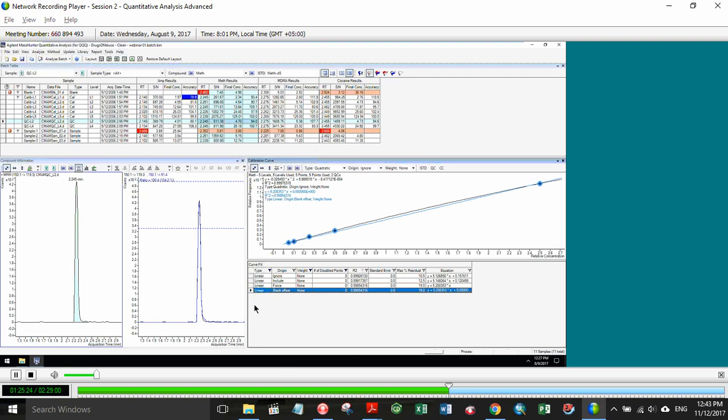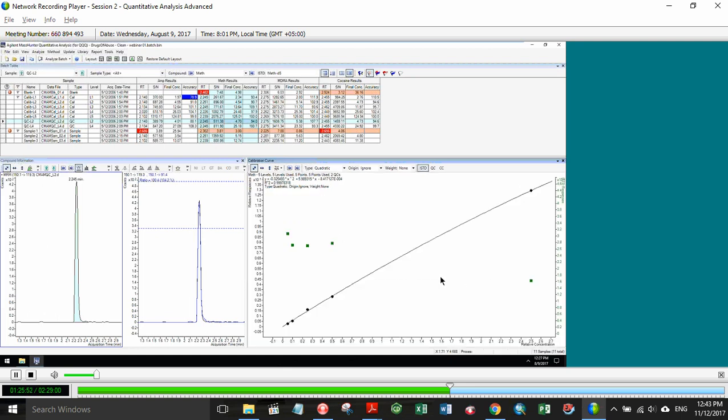That's a little bit of a loaded question. Okay. Typically, when we turn on the internal standards, the green squares, we would like to see that be as linear as possible. But in reality, what I do note, and you can probably see it in this one, is that as we went to the higher concentrations, we now have this internal standard response being much lower than the other four values here. That's probably due to a phenomenon called ion suppression that we are encountering right now.